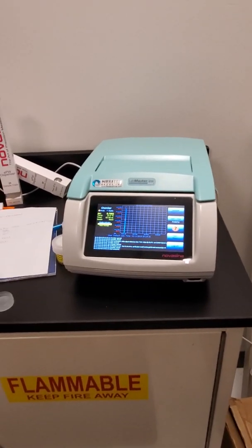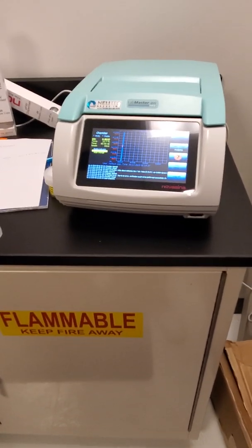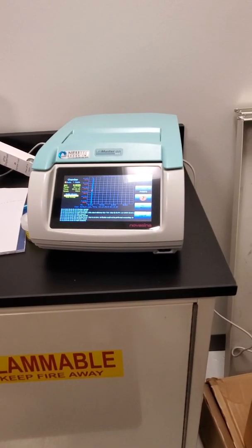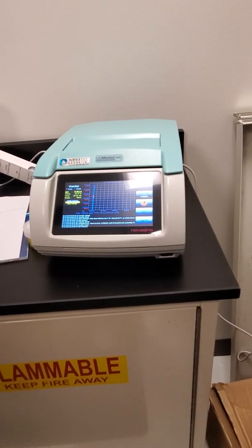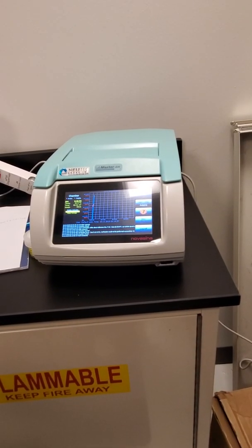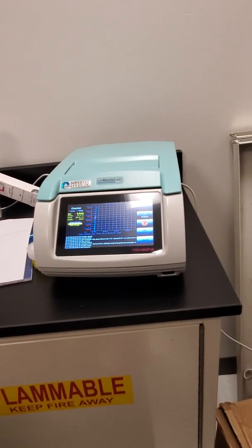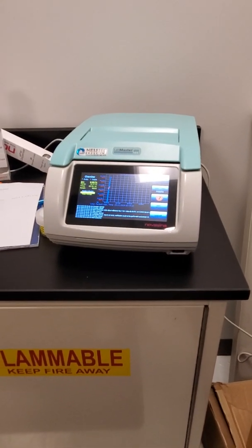If you're not sure, you can leave it at the present setting and just let it go and check it. And if it's a flat line, then you know that you've reached the point you're good to go. If you're seeing an additional big change, like say you put it on fast and ran it, and then it kept going, and it was 0.1 different by the time it went 20 minutes versus what you got on fast, then that's an indication you probably need to move to average or slow in order to get that. Why don't you just leave it on fast all the time?